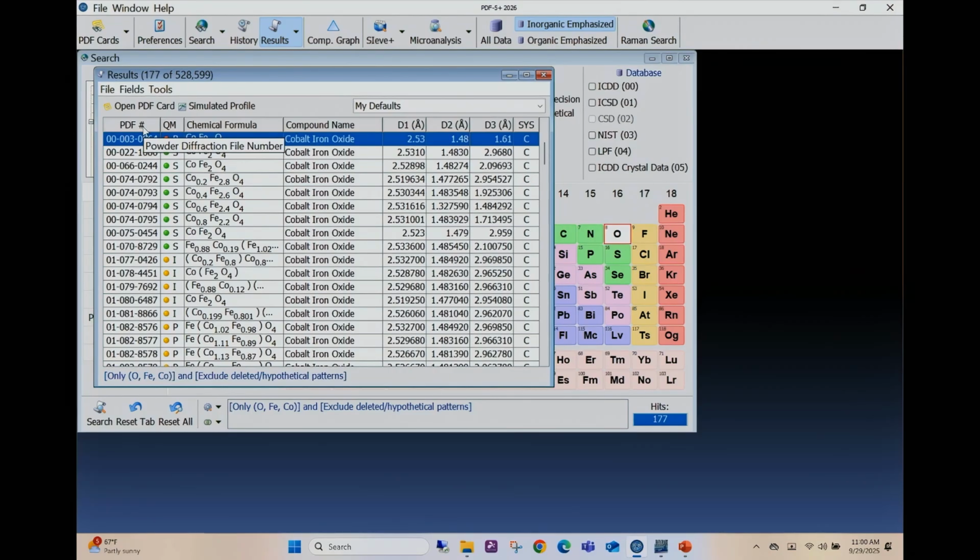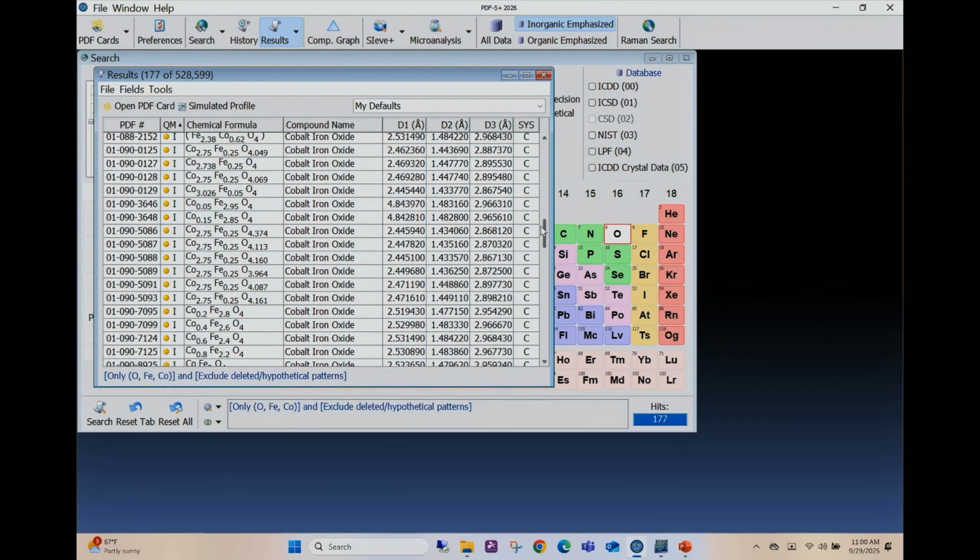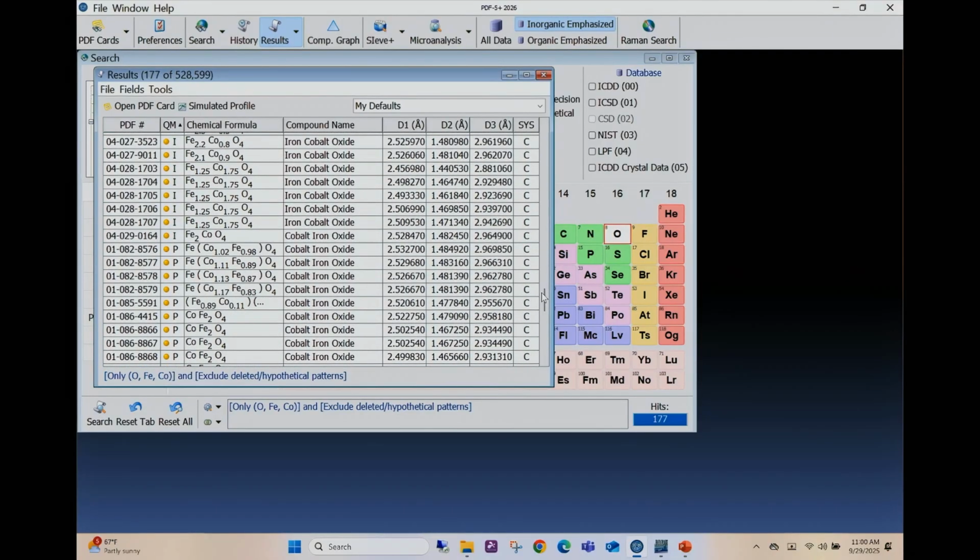But if I wanted to say, show me something about quality marks, and I click on the quality mark column, it will rank order them from the highest quality, next highest quality, down to the low quality, okay? So remember our green, yellow, red from earlier? Green, go. Yellow, if you're driving, what's yellow mean? Hurry up and go.